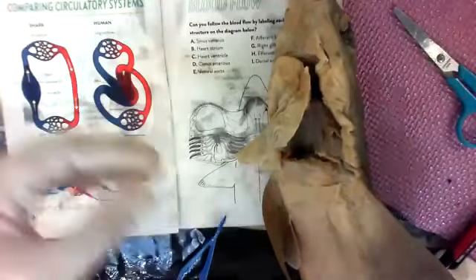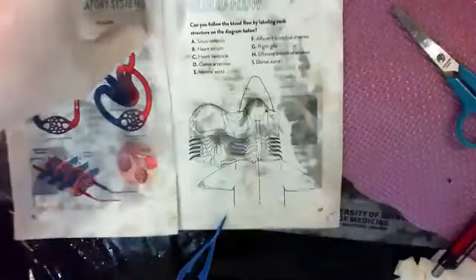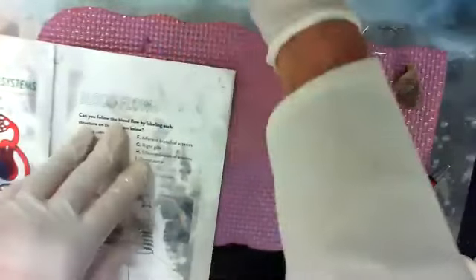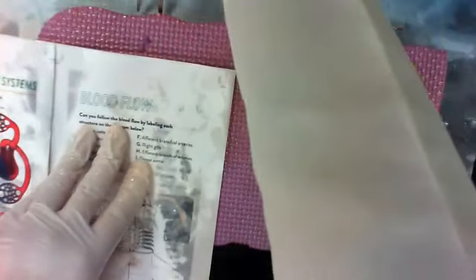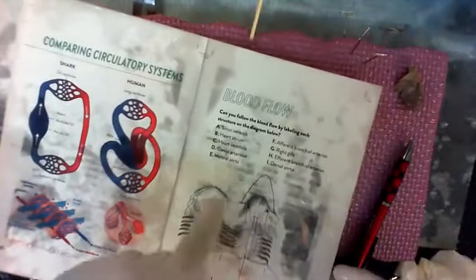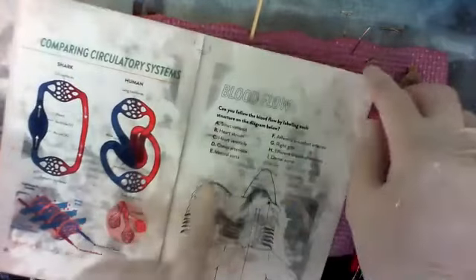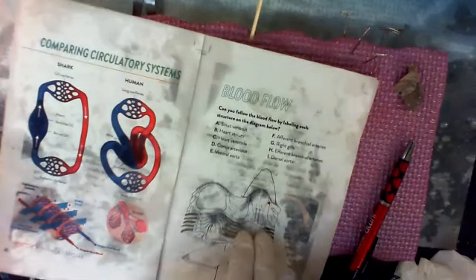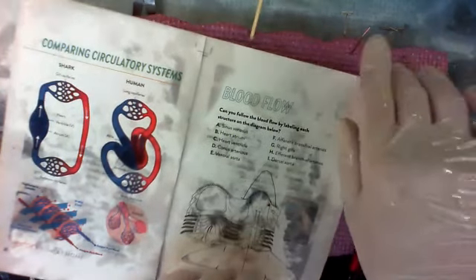That should give me all 6 of my sharps back. My heart, I'll stick it here. 1, 2, 3, 4, 5, 6 sharps. Sharp pins, my scissors. Oops. And my probe. All right. And then you can actually match these up with the letters if you want to sometime, but you can follow the pathway. Remember, the ventral aorta comes out, afferents go into the gills, efferents leave the gills, and then the dorsal aorta.